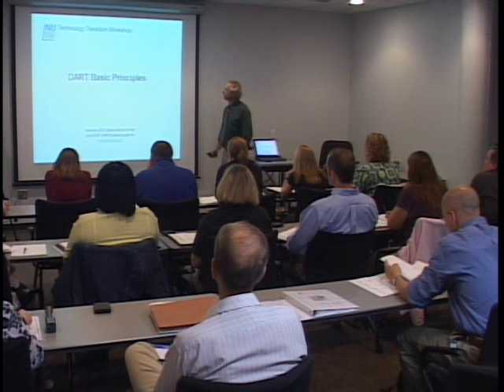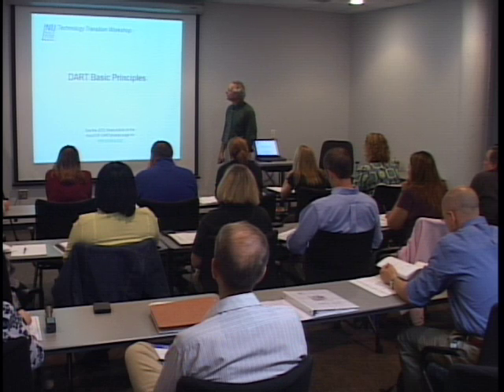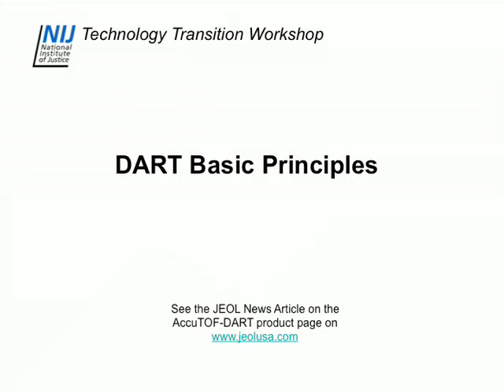Now let's get to the core of this and talk about the basic principles of DART. There is a JEOL News article online. I think it's also in your handouts, but it was an article that is public domain, non-copyrighted, that you can use, that has all of the basic information about DART, a lot of which was in the original analytical chemistry article. And so that's another good resource for reviewing some of this.